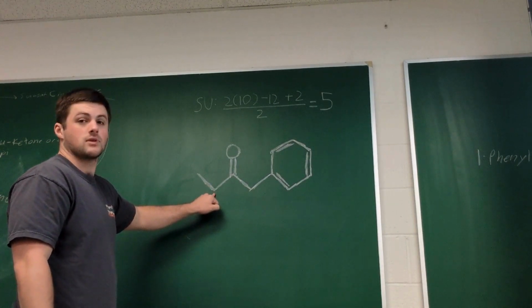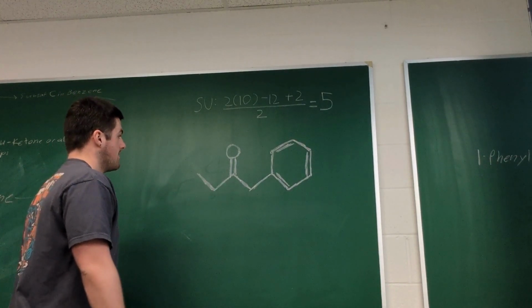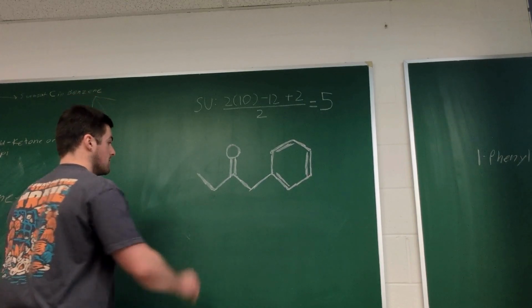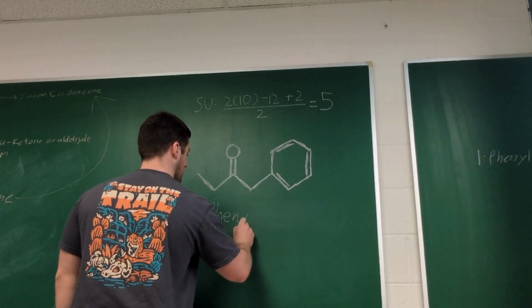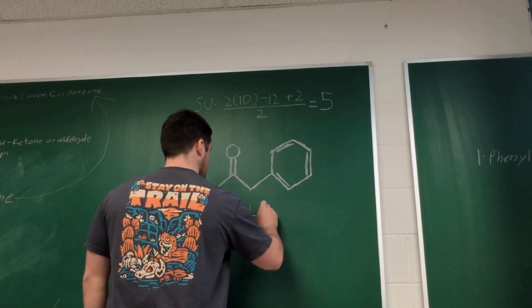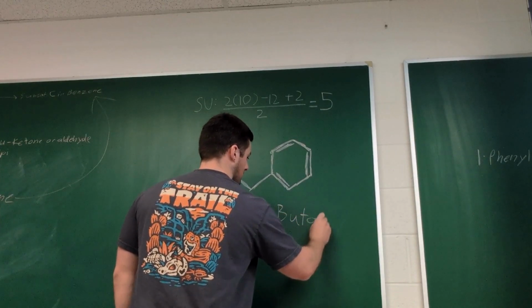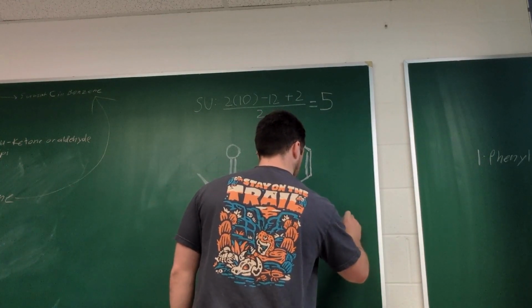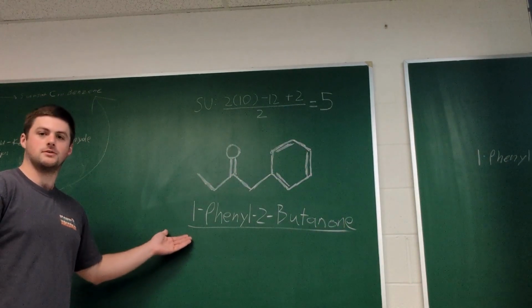And because of that, my finding is that this molecule is 1-phenyl-2-butanone.